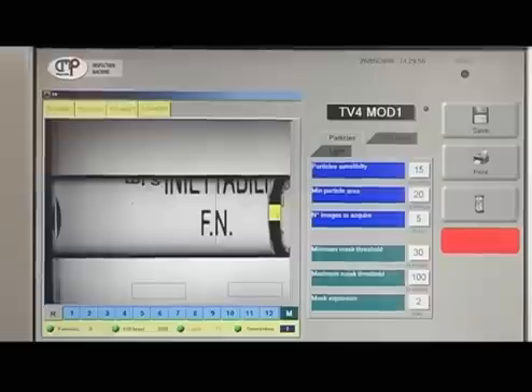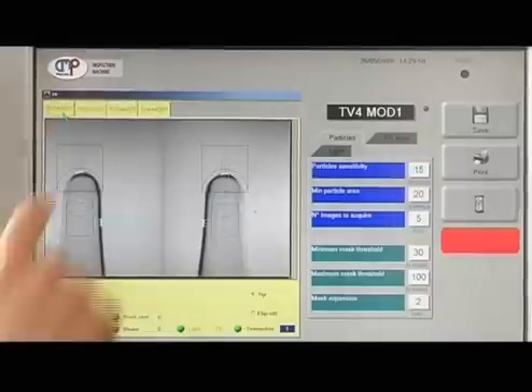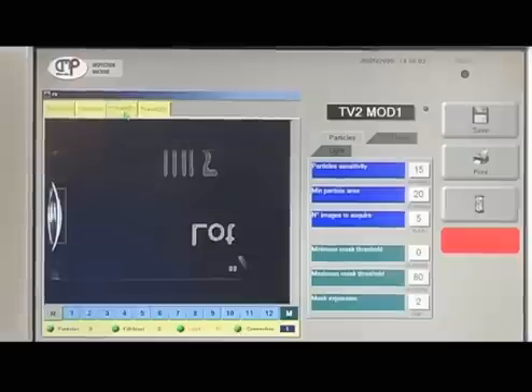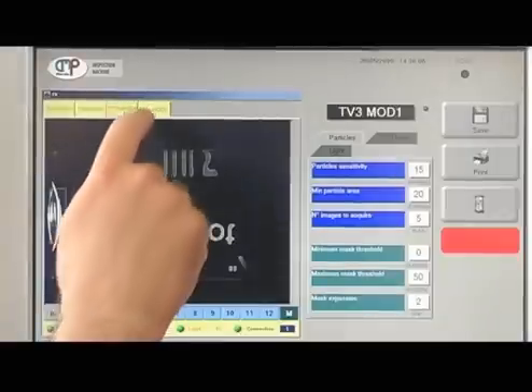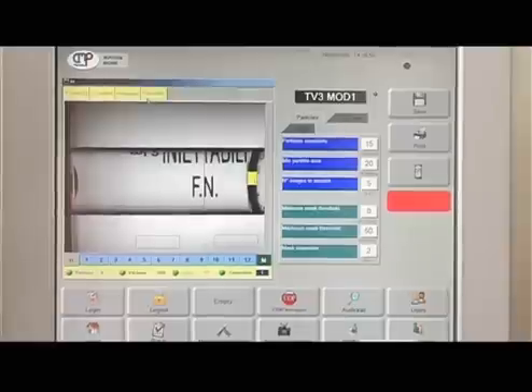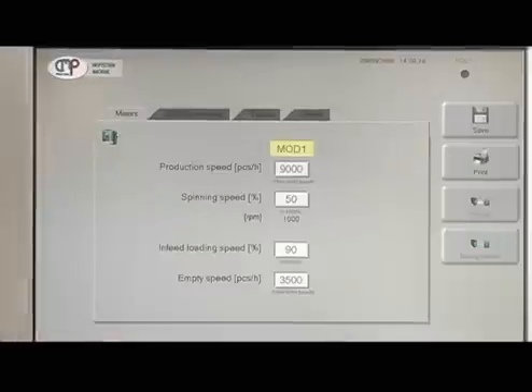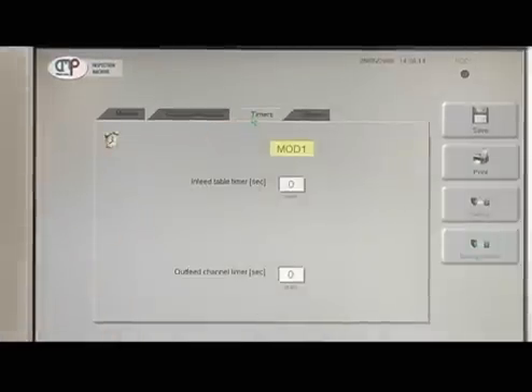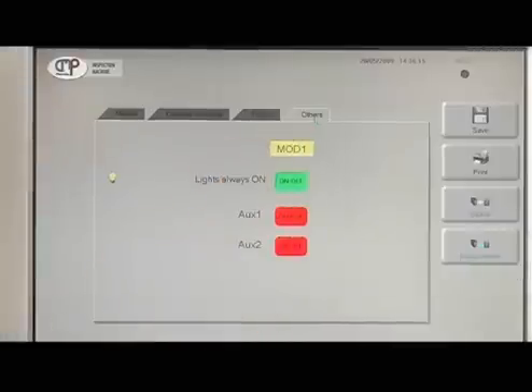The entire management of the machine is supervised by an electronic system that includes highly reliable components, also comprising a Siemens PLC. The management software is fully compliant with Regulation CFR 21 Part 11 and favours optimum use and adjustment of the equipment.